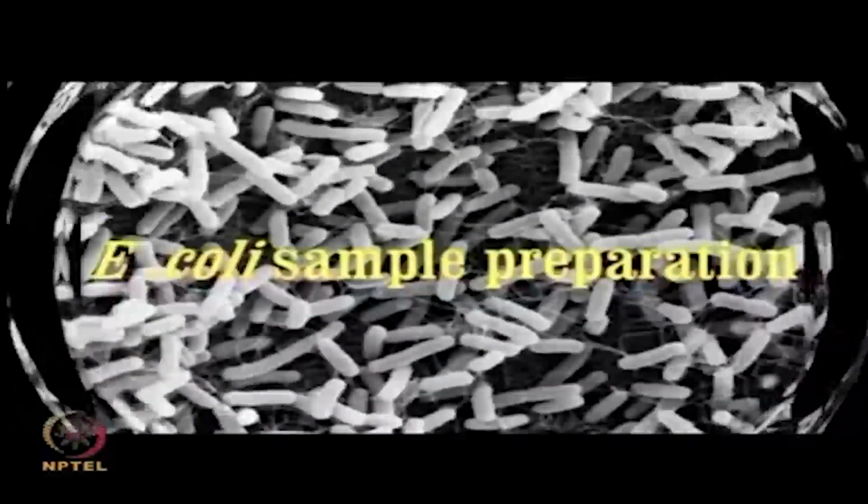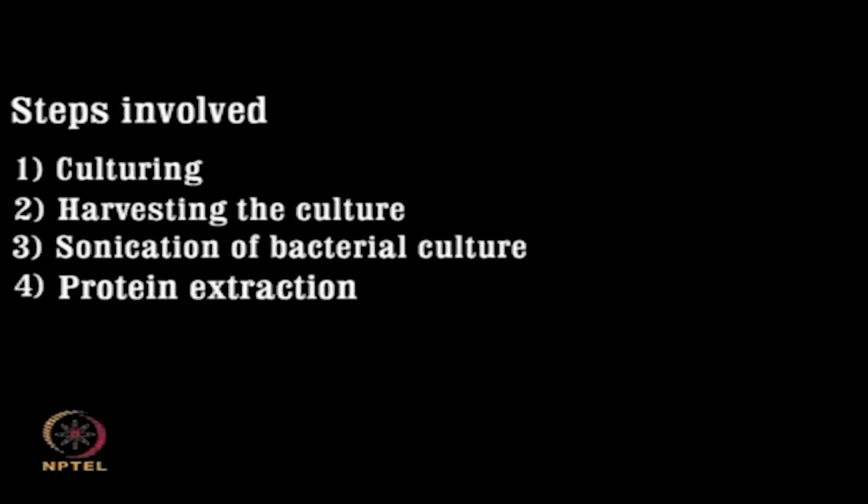Bacterial protein extraction. This process involves culturing of bacteria, harvesting and sonication of the obtained culture, followed by protein extraction. Bacterial culturing.